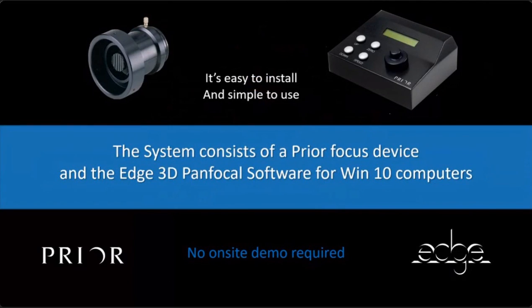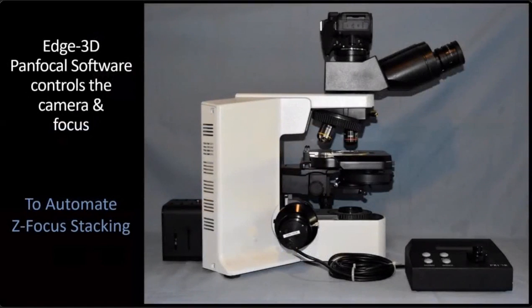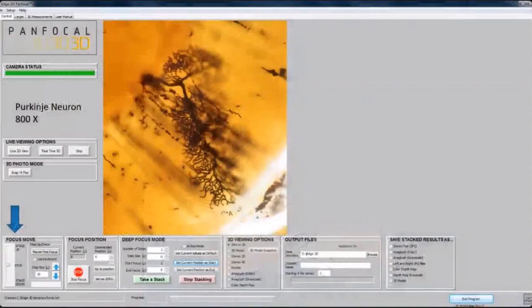It consists of a Prior Scientific focus device and the Edge 3D panfocal software, which goes onto your computer. There's no on-site demo required. You just receive it and hook it up to your microscope. So this is an old 20-year-old Olympus microscope. What you do is you hook up the camera. The software controls the camera and the focus device. The little focus device goes over the focus knob of your microscope and it automates Z-focus stacking.